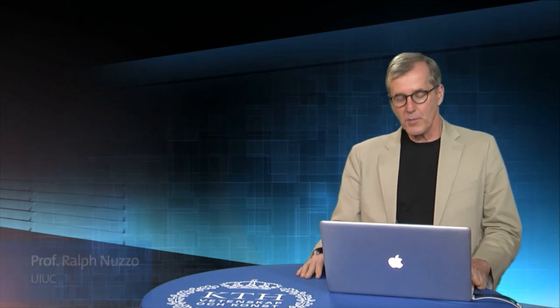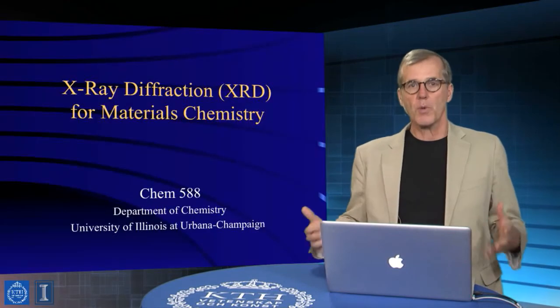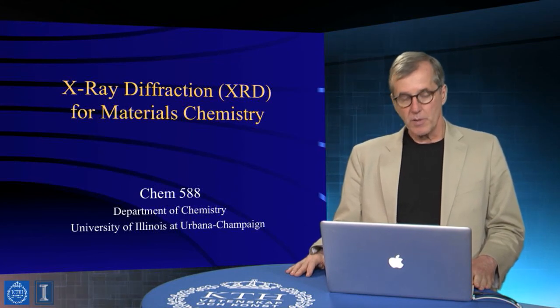Hello again. I'd like to, in this next lecture, give you an overview of applications of diffraction measurements in materials characterization, and just give you a highlight for the kinds of questions X-ray diffraction is best suited to answer.